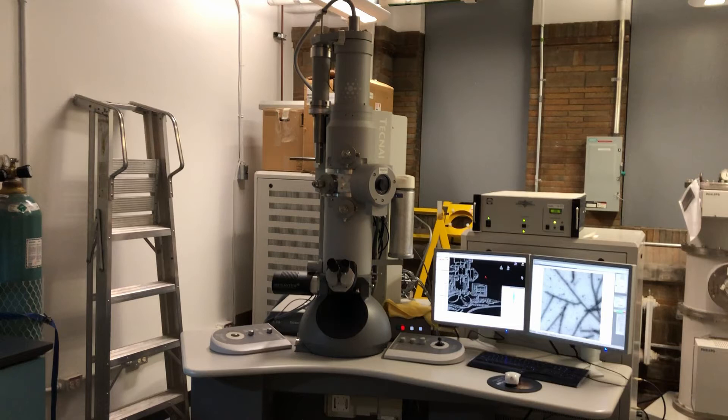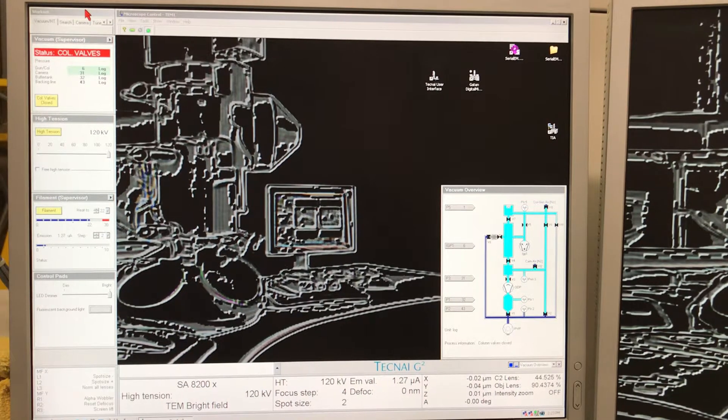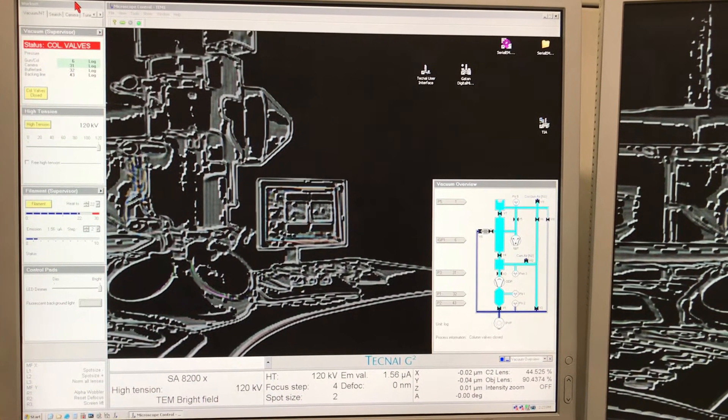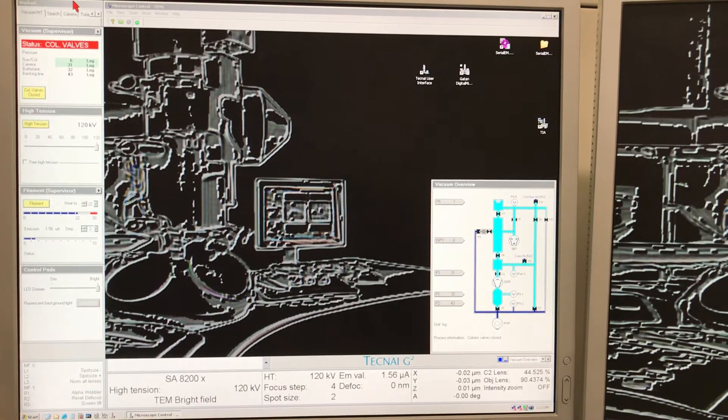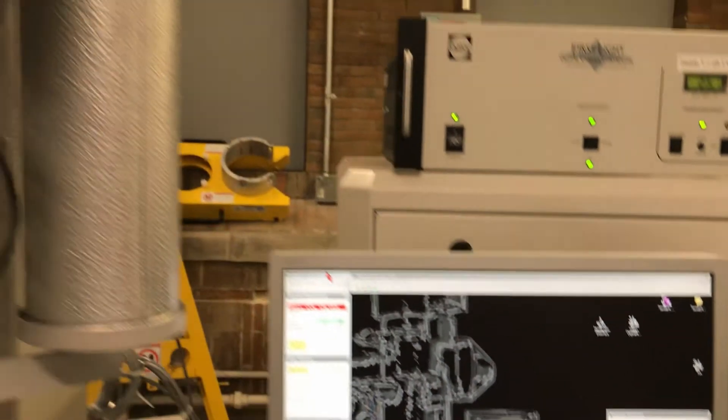Hello everyone, today we are going to learn how to take images with the TecNai electron microscope. Now we are ready to load a sample into the microscope, for which we need to remove the room temperature holder from the microscope.